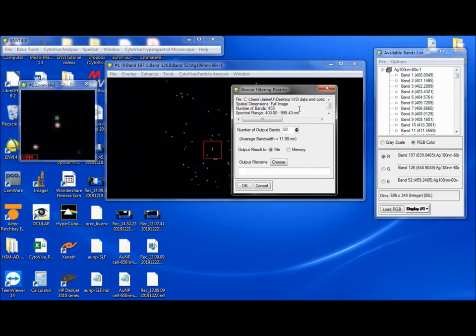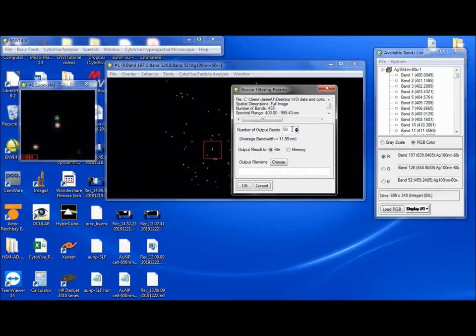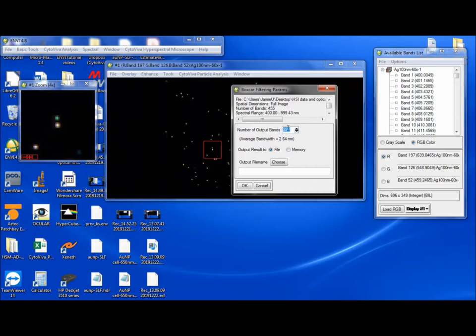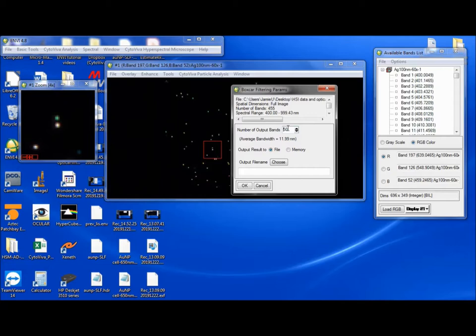And what this does is this is going to actually smooth the data by reducing the number of bands. It's going to reduce the dimensionality of the spectral resolution. So, for example, here it defaults to 50 bands. So if we put in 455 bands, which is the number of bands we have, we have a 2.64 nanometer resolution. So what we can do is enter in a certain number of bands. So if we want to make it 50 bands, the spectral resolution goes down to 11.9 nanometers. It goes from 455 bands down to 50 bands. So if I do this, I'm just going to commit this to memory.